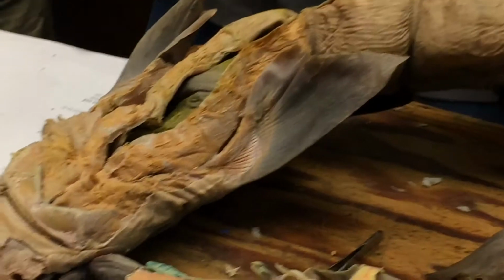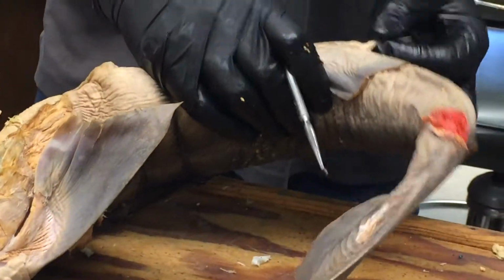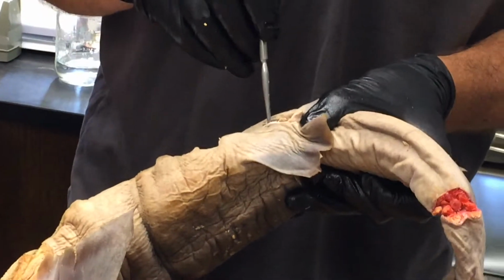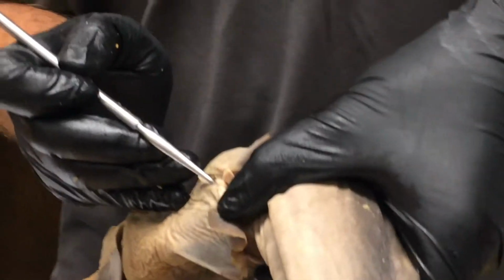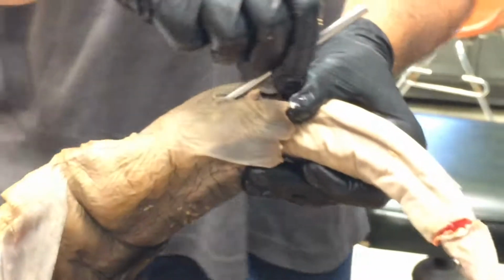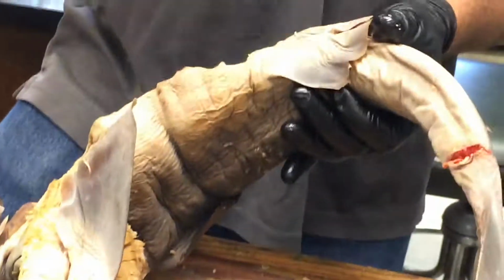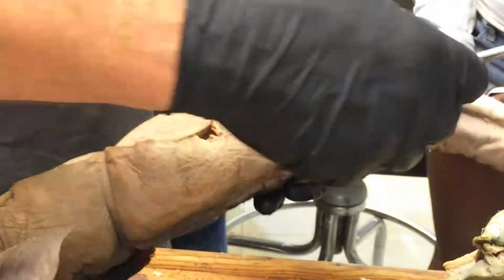Okay. So, regarding the urodeum, is that just the opening from the uterus in the cloaca? It's not from the uterus. I mean, I'm sorry, I'm thinking of another word then. So if we look in the cloaca, you can see there's a fold across it here. Do you see? Here's the papilla. There's a fold of tissue right here. And if we go in front of that fold and pass a probe forward, it ends up in the gut. That region is the coprodeum. Copro means poop, and that's the root, like coprophagy, where rabbits eat their own poop. And then the urodeum is the back region of the cloaca here, where the urinary papilla is.